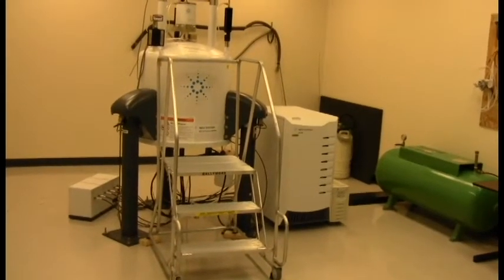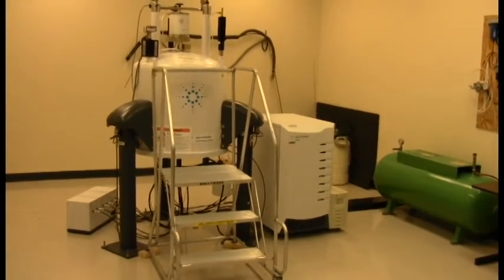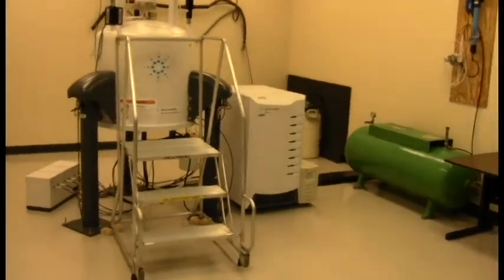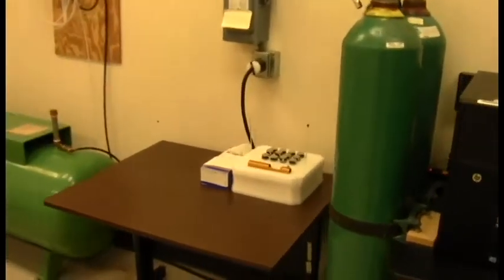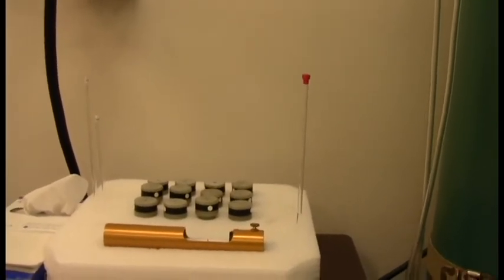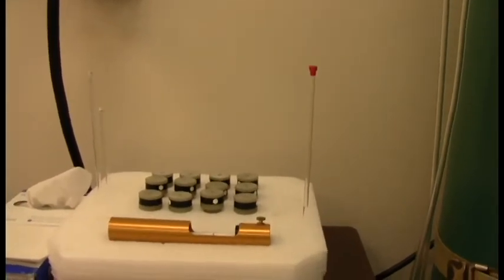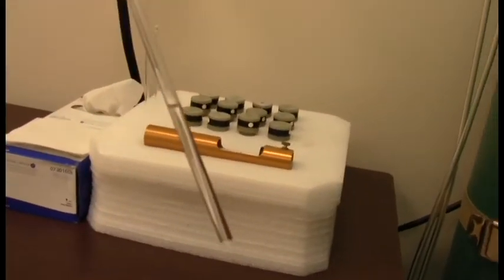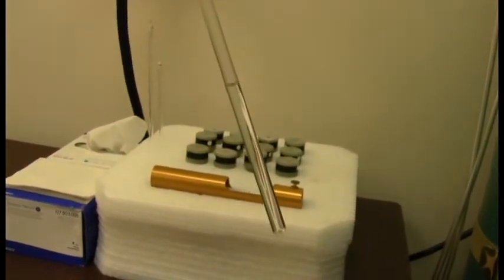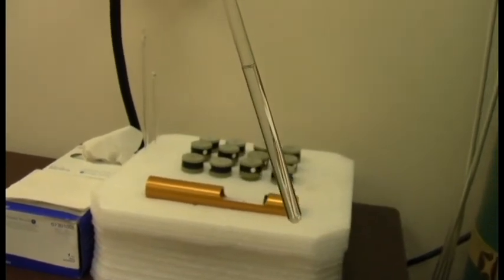Finally, I thought we'd end this section with a field trip down to the spectrometer itself. There is the big magnet that we've been hearing about. Over here we have a sample tube prepared. It's simply our reference standard methyl ethyl ketone. So it's a sample of some molecules that we wish to study, dissolved in a little deuterated chloroform. And we get that tube in a holder and ready to go into the magnet itself.